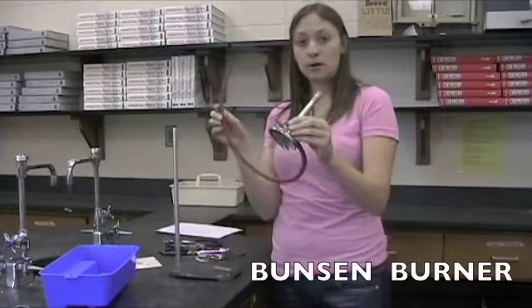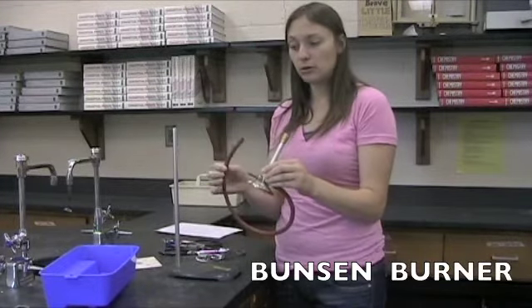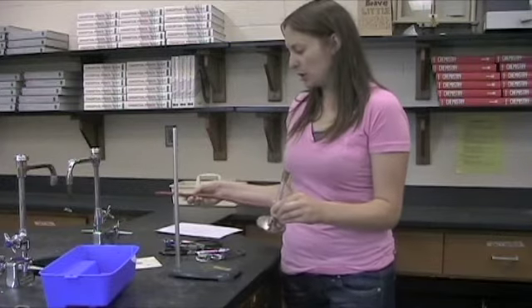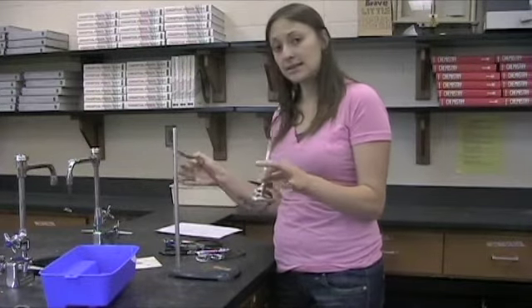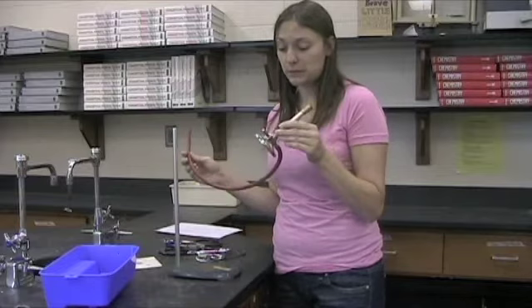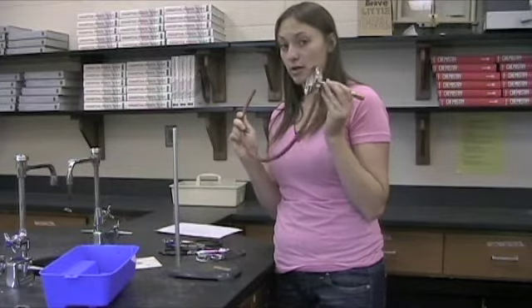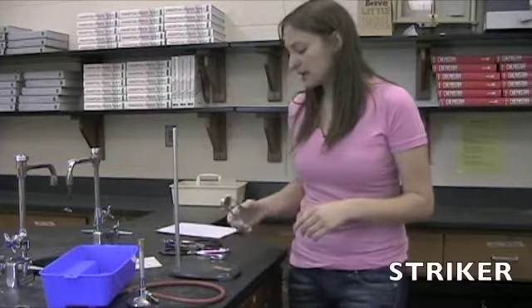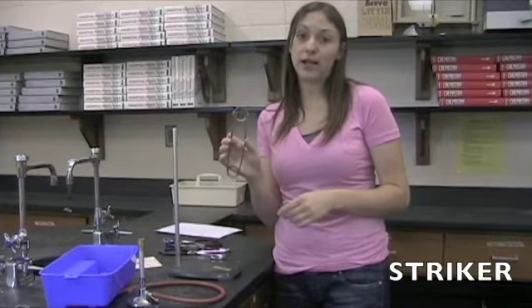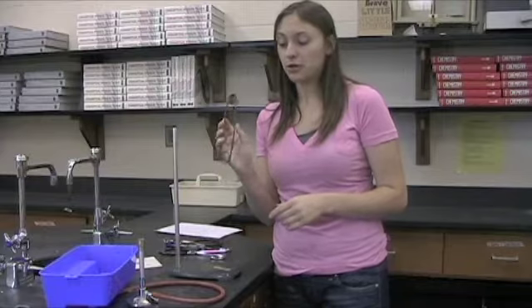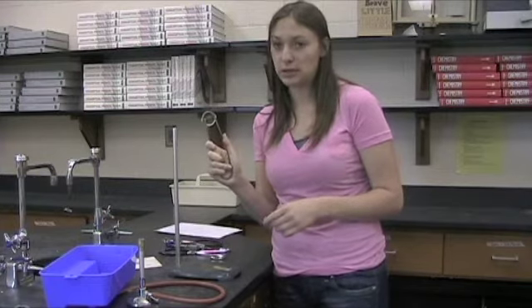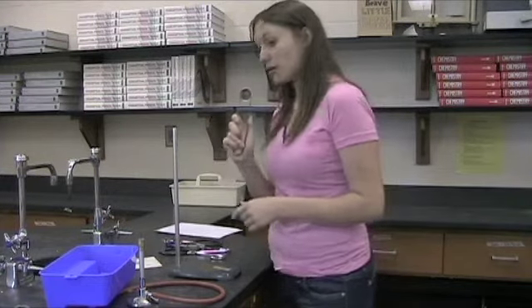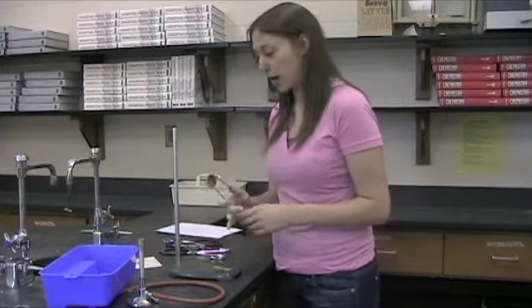You have a Bunsen burner and tubing. Bunsen burners you will look a lot more at in your lab tasks as how to use these. But this is our main source of fire. Lighting a Bunsen burner. These take these strikers or flint lighters. They are just used to light the burner. And we'll talk more about ways that people will misuse these or abuse these later. These are lighters or flint lighters, strikers.